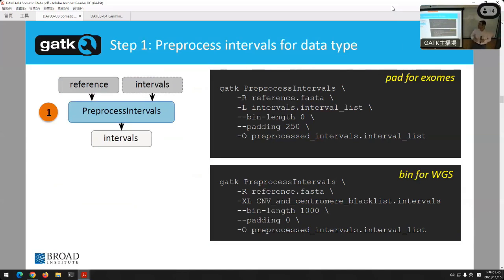There's also a lot of information in the reads beyond the actual targets though. So what we do is we create an interval list padded on 250 bases on either end of the baits, and use that information. So first we're setting things up so we can parallelize it all the way, and also not look at reads that are not near the exon.